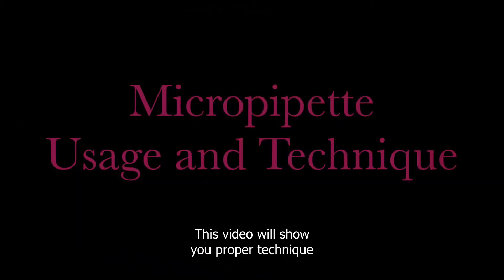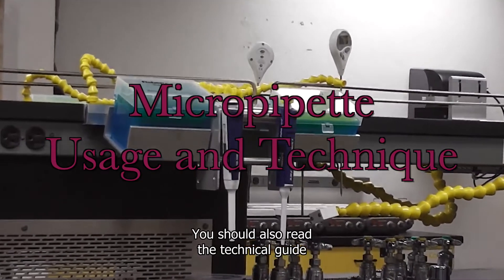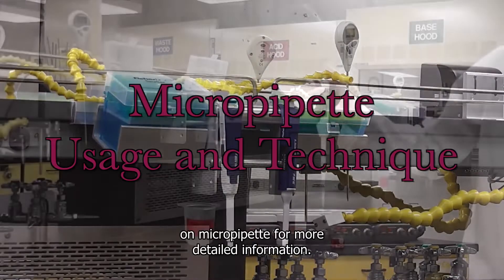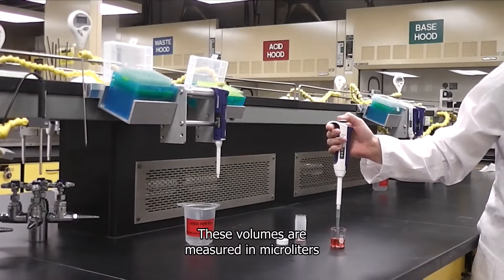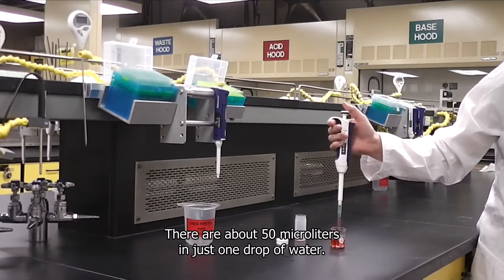This video will show you proper technique for using a micropipet. You should also read the technical guide on micropipets for more detailed information. Micropipets are used to accurately and precisely transfer very small volumes of liquid. These volumes are measured in microliters — there are about 50 microliters in just one drop of water.